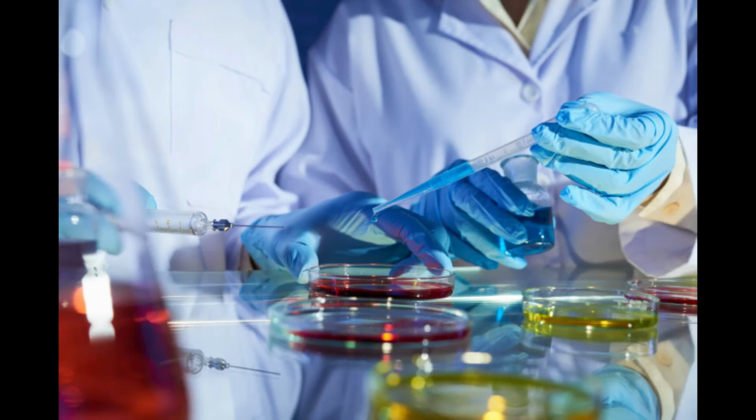That's the broth. Now, the slant tube. The slant tube, you will also use a loop for. The slant tube is a solid one, so it's not liquid, and you have two solid tubes. One has agar that was poured and it just sat there and solidified straight across. The other one is the slant. You see how the agar, I let it solidify at a slant, so you have that slant there.